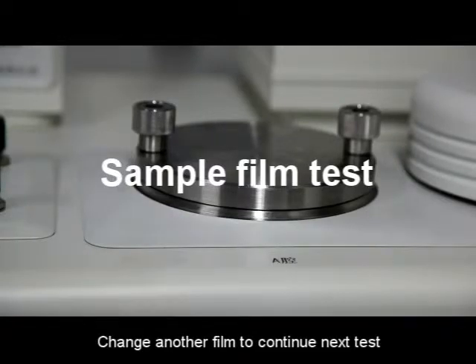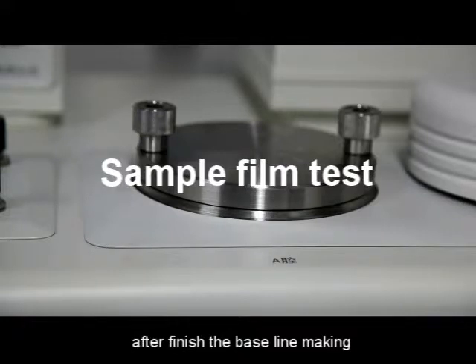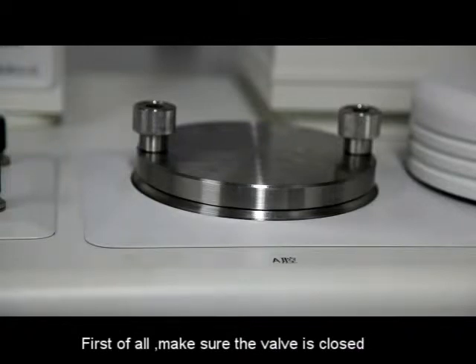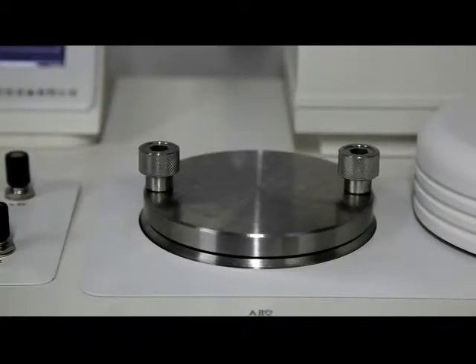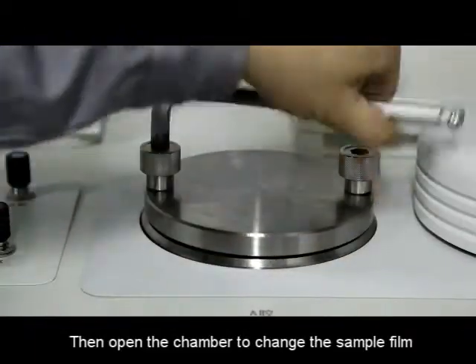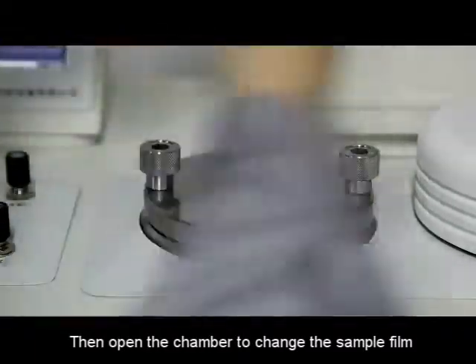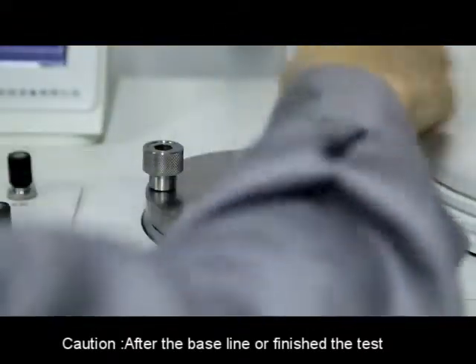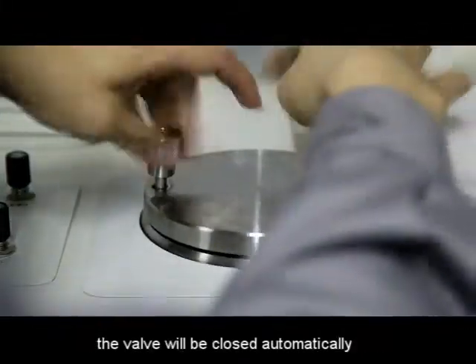After finishing the baseline, change to another film to continue the next test. No need to turn off the instrument. First, make sure the valve is closed. Then open the chamber to change the sample film. Caution: after the baseline test is finished, the valve will be closed automatically.